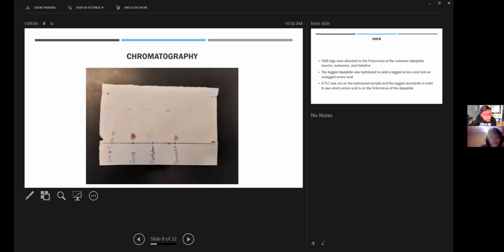And this just emphasizes that we were just pulling straws from a hat. With this one being on the first day, there was no motive, no reason for testing those specific amino acids. Those were just ones that we literally pulled from the bin and did chromatography on, trying to see what we got.